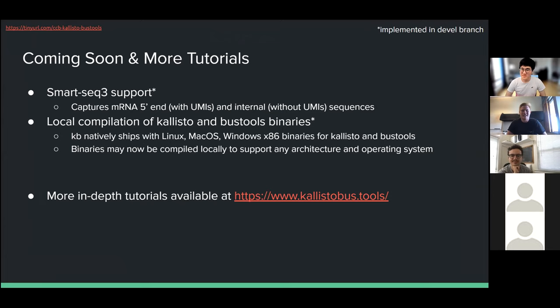Joseph, can I ask a quick question? Yeah, sure. I think the obvious question is, how does this compare to Cell Ranger? I assume that you guys have done some comparisons on this pipeline, the Kallisto bustools. Are there any downsides? What comparisons have you done on that?